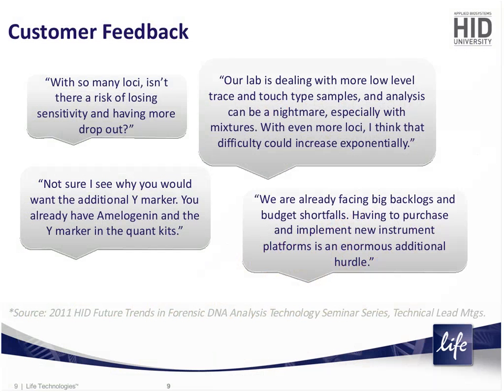At the time of the recommendation, and in light of the other expansion of international standard sets, such as that conducted by the European forensic community, we started to talk to laboratories about their concerns around potentially building such a large and complex multiplex system. And on the screen you can see just some of the feedback that we obtained during some of those interviews with operational forensic laboratories around the concerns that they had about the potential compromises that might need to be made with such a complex system.